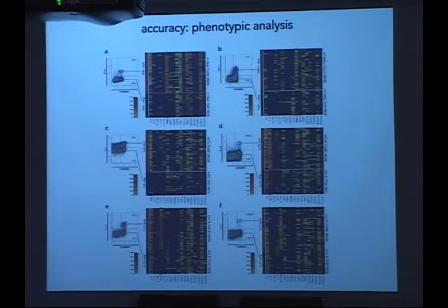So what we did was we used the Miltenyi kit, stained with interferon gamma, for instance, and we sorted positive and negative populations for each individual cytokine, and then put it through our assay. So we sorted the single cells and looked at what kind of readout we get through our analysis. And you can see that we get really highly accurate reads in comparison to the Miltenyi kits. So for instance, this is interferon gamma, where we take the positive population and we can hit interferon gamma signal in 92% of the cells. And in the negative cells, we get no signal whatsoever.